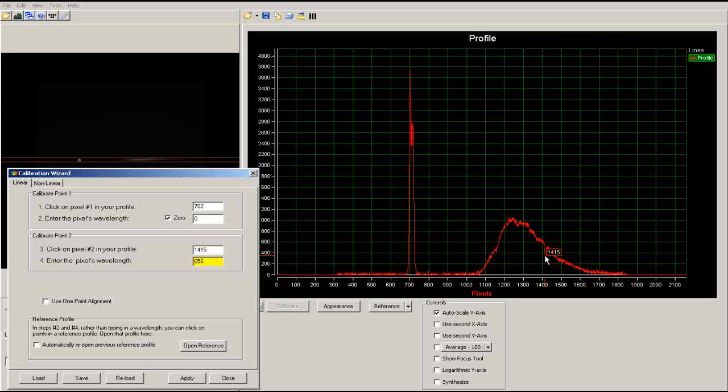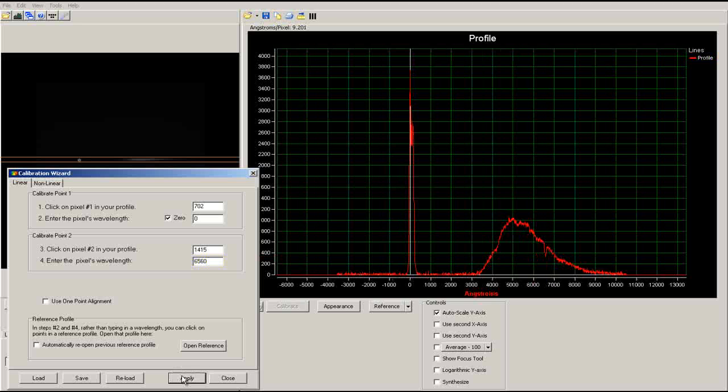Remember that our spec measures wavelength in angstroms, not nanometers, so your wavelength should be multiplied by a factor of 10. Finally, click apply at the bottom of the calibration menu to calibrate your spectrum.